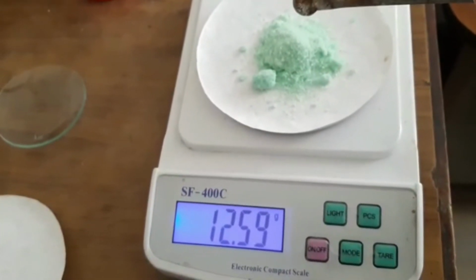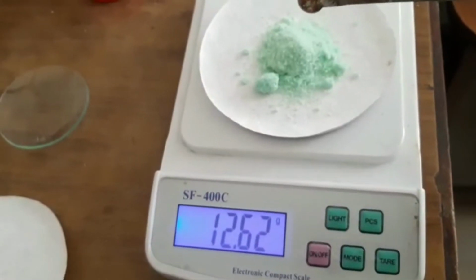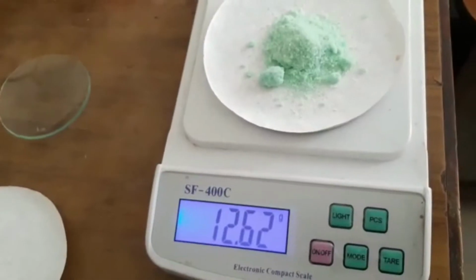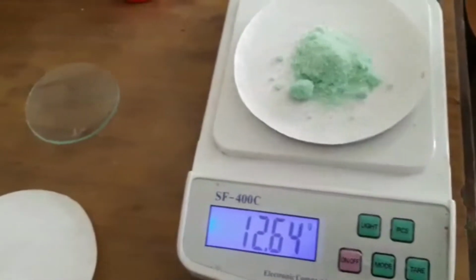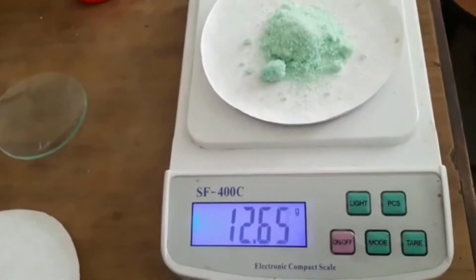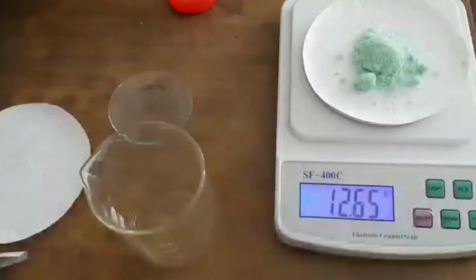So towards the end, add very slowly. Yeah, so this is almost done. This much error is allowed. Yeah, this is exact 12.64. That is 12 gram of ferrous sulfate. 0.64 is the mass of paper.